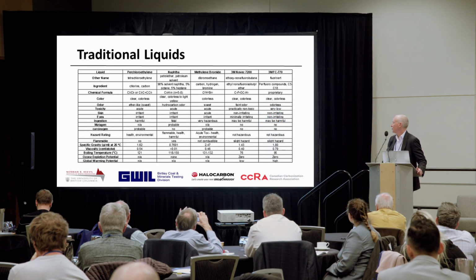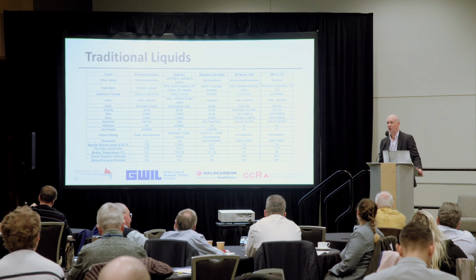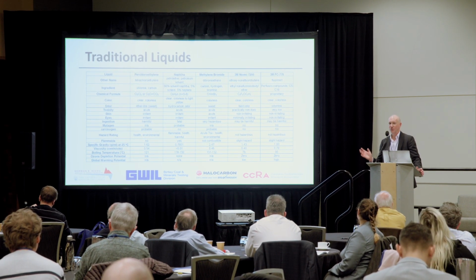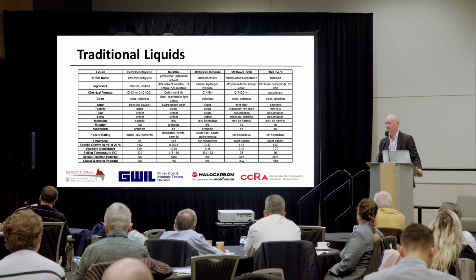So when it comes to the fluids that we use to get the different SGs, the table's got a lot of information here, but this is typically what we use really internationally. Everywhere in the world has been using these fluids. Just before COVID, we were looking at alternatives for these fluids. So the two on the far right-hand side, the 3M products, we did some research on those two individual fluids. Long story short, 3M is no longer producing those fluids, so they're off the market. They're obsolete.